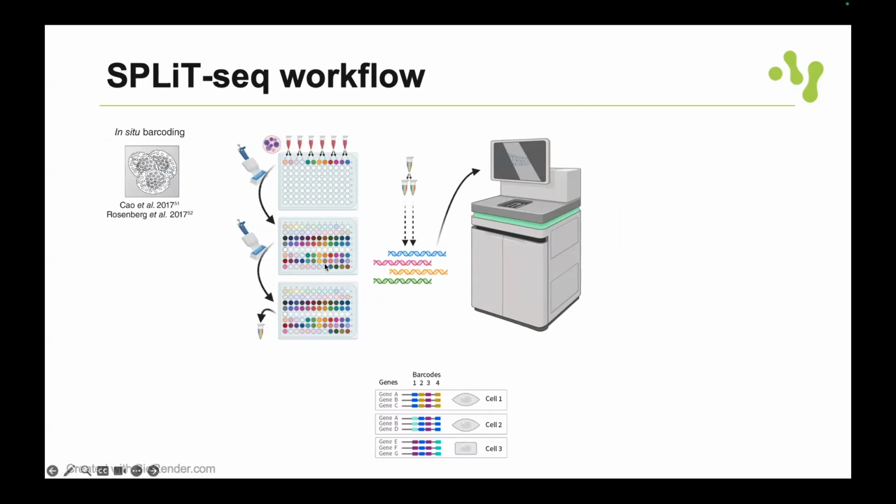Here you load your cell suspension, which is a mixture of cells, but you could load one sample to each well, or you could split them to more than one well. In this example, in the first row of this plate each well has a unique sequence.